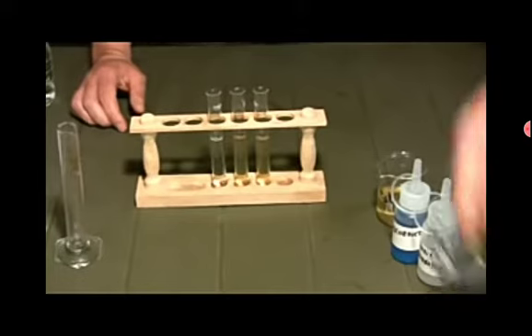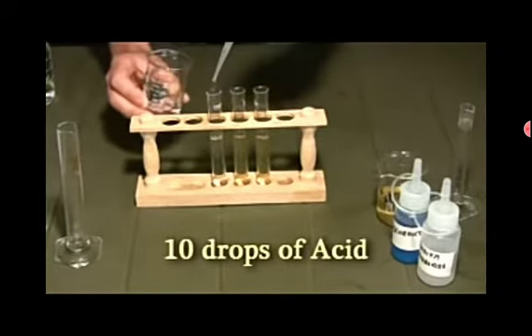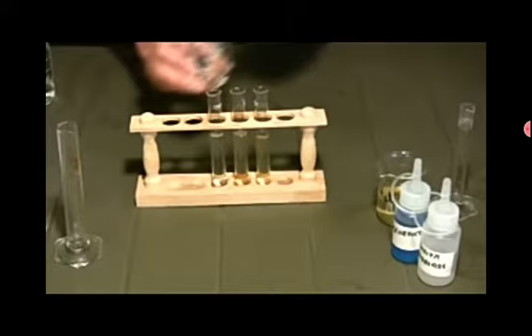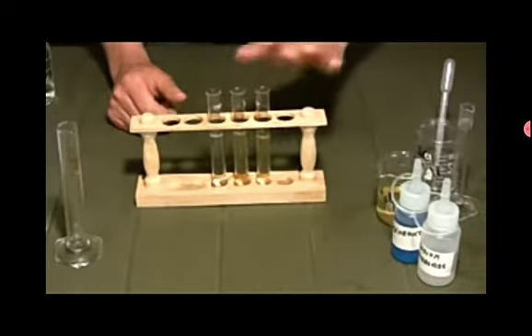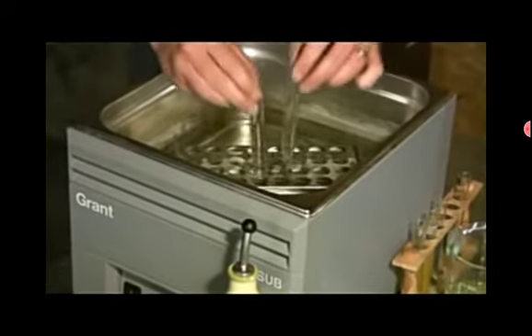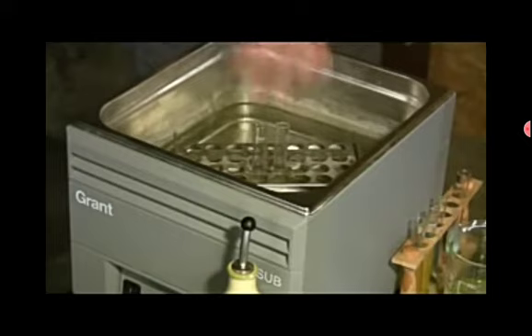And we're going to add a few drops of hydrochloric acid in the test control. This one we don't put any hydrochloric acid, we leave it aside. We're going to take those 2 test tubes and we put them in the water bath for a few minutes.